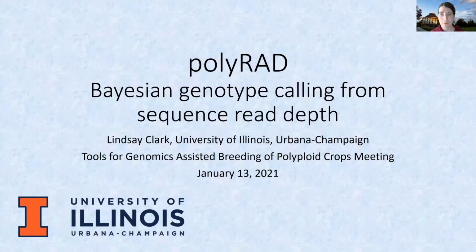All right, so thanks for the opportunity to talk today. I'll be discussing my R package polyRAD, which does Bayesian genotype calling from sequence reads.